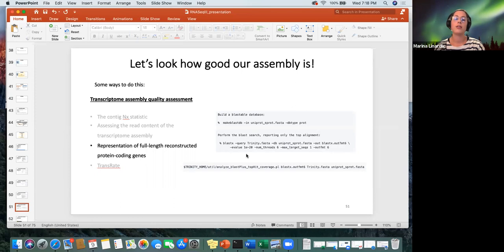You can determine the e-value, so what the threshold will be, the p-value. You can also assign how many CPUs you would like, and how many sequences you would like it to pull if there's more aligned. You can choose different ones, and also you can choose a different format of how you want this document to be presented, and I will show you this as well.